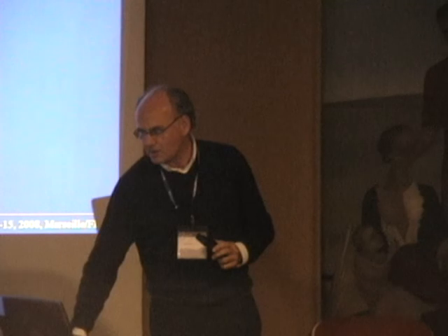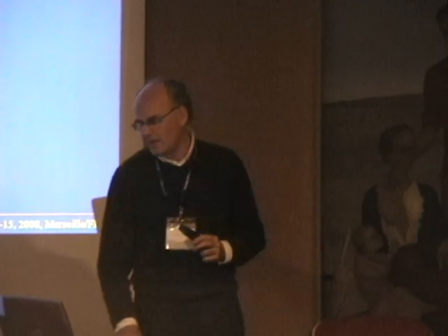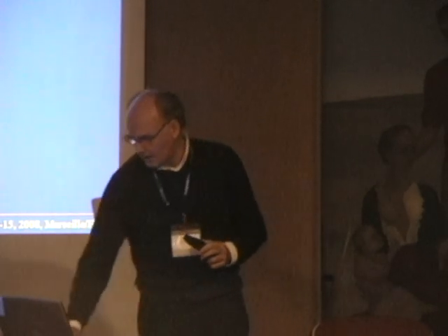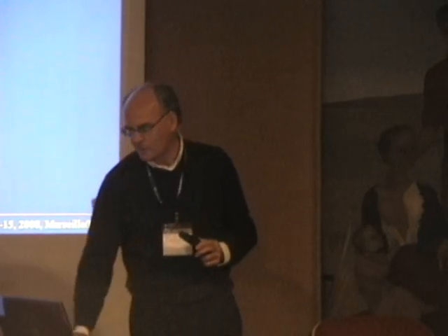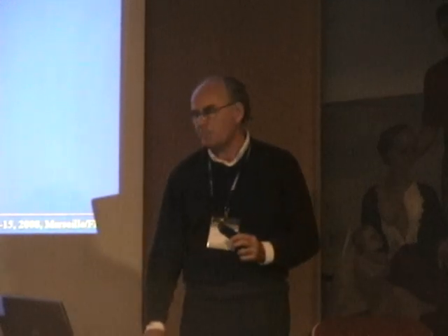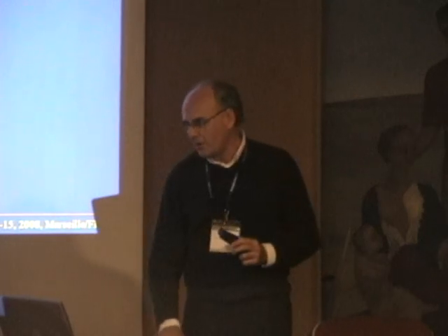So if you see this good resolution, you may come to the conclusion that in vitro MRS actually examines the same metabolites as we do in vivo MRS, but at a higher resolution. So is it really the same thing that we are observing? That's the question. Is this hypothesis right? Is this correct? I would say basically yes, but there is a number of points why there are differences between in vivo and in vitro spectra.